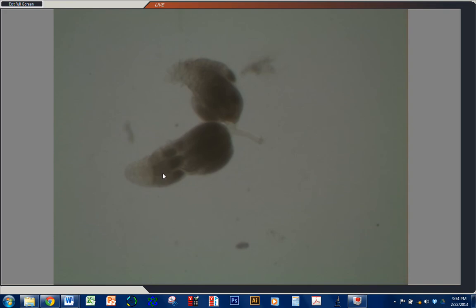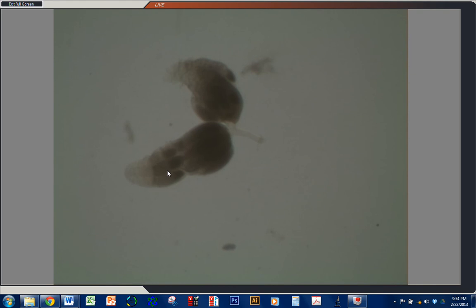You can see, in the middle of the ovary here, we have an egg chamber, where the dark structure here is the oocyte, and then these cells here are nurse cells. This is another egg chamber, and a third egg chamber here. There's more mature eggs back here in the posterior.